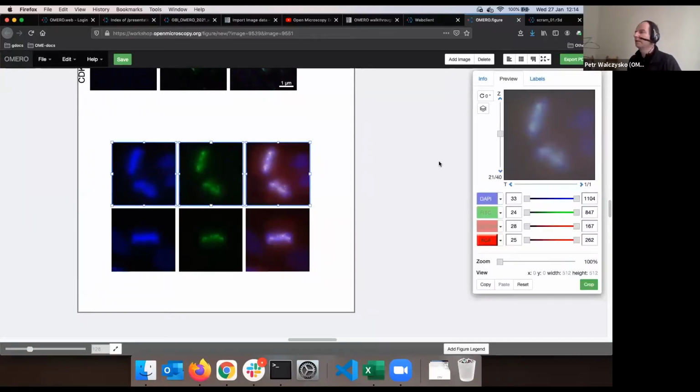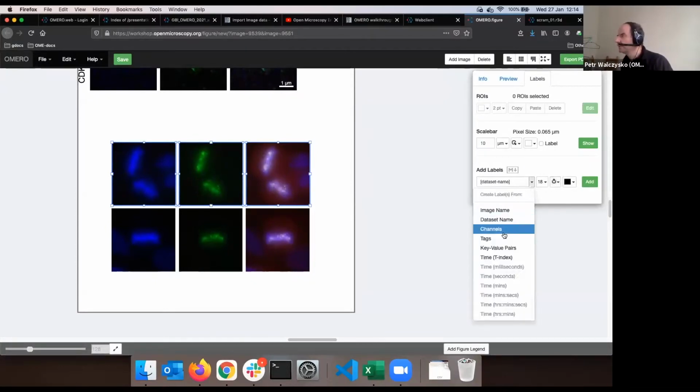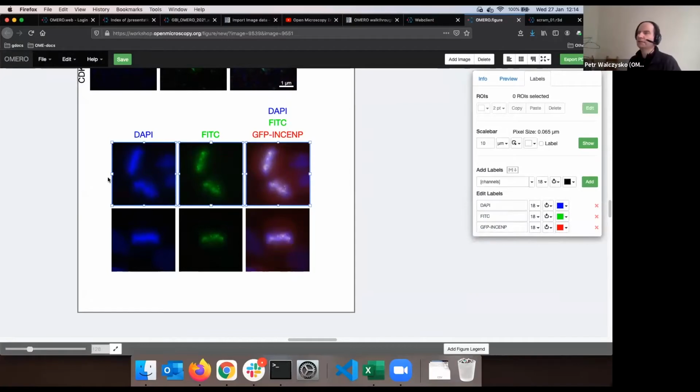And now again, I would do the channel labels on the top. That's quite fine. Actually, 18 is a suggestion. Yes, but it's a wrong position. So I say the top, and it's not dataset name, it's channels. And go for me. Again, these are the channel names.